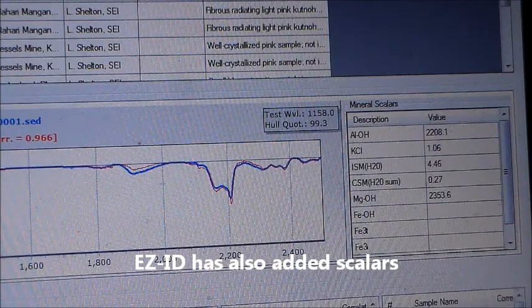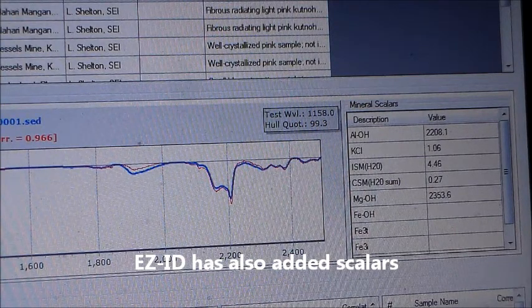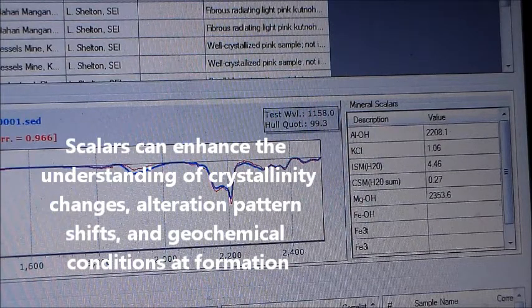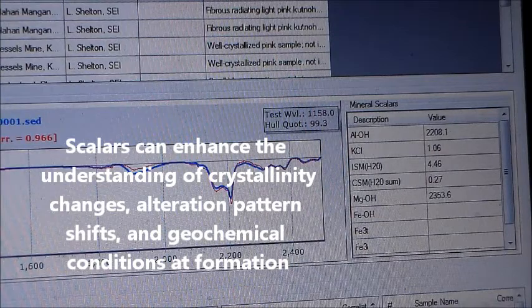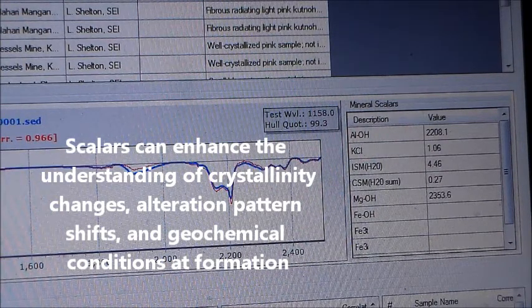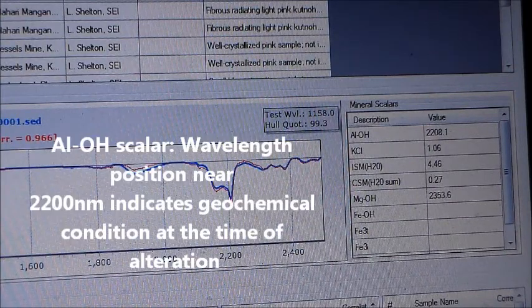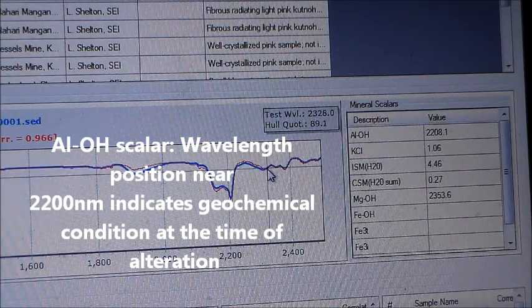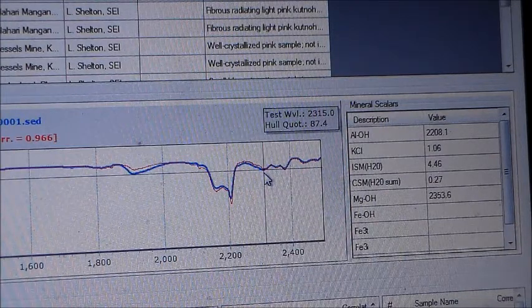To provide additional understanding of your samples, EZID has added scalars. Scalars can enhance the geologist's understanding of crystallinity changes, alteration pattern shifts, and geochemical conditions at formation. The ALOH scaler measures the wavelength position near 2200 nanometers of the ALOH absorption feature to provide geochemical information at the time of the alteration event.